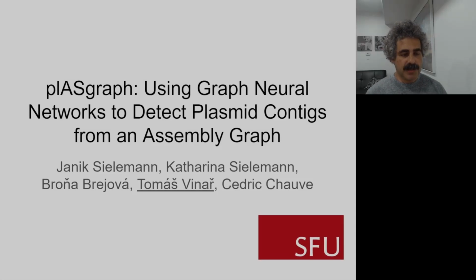Hello, my name is Tomas Vinar and I am going to tell you about plASgraph, a new tool for detecting plasmid contigs from assembly graphs.